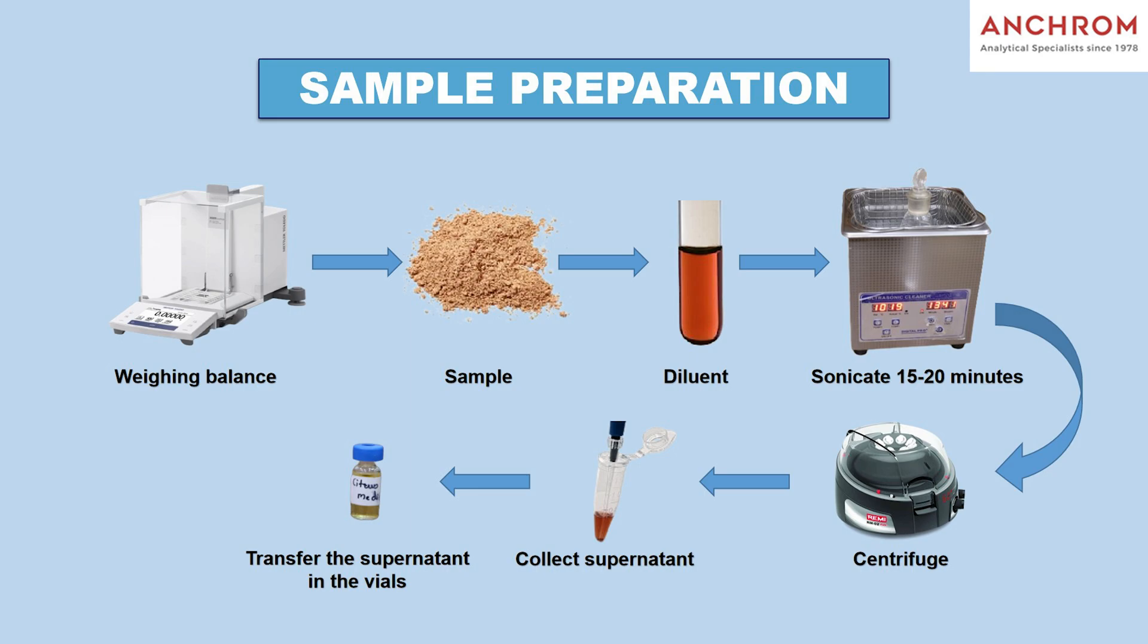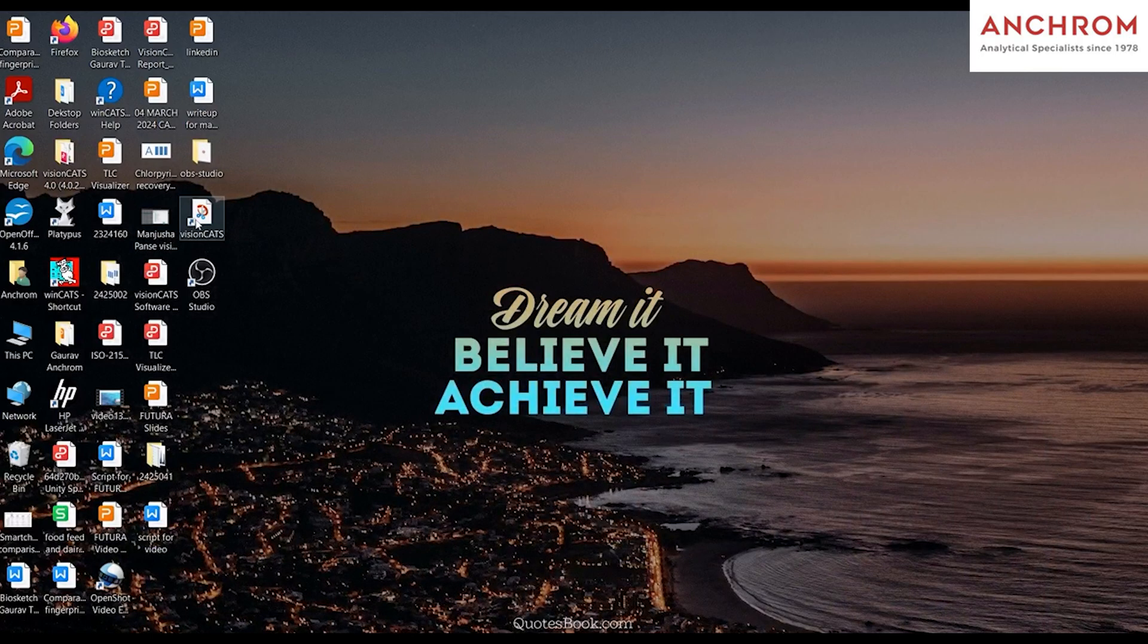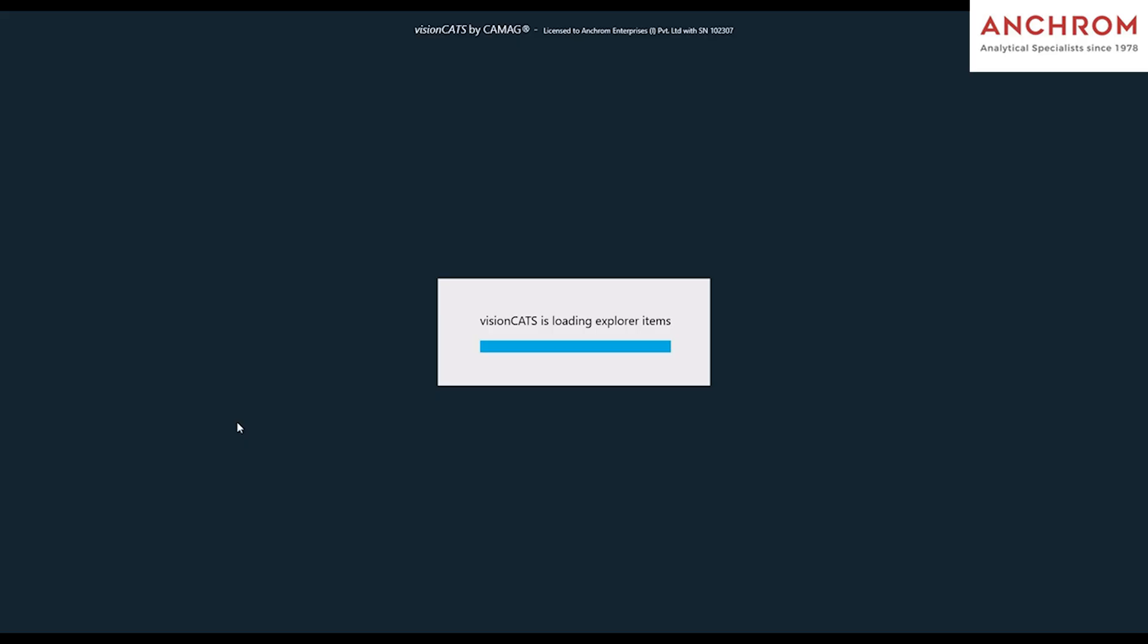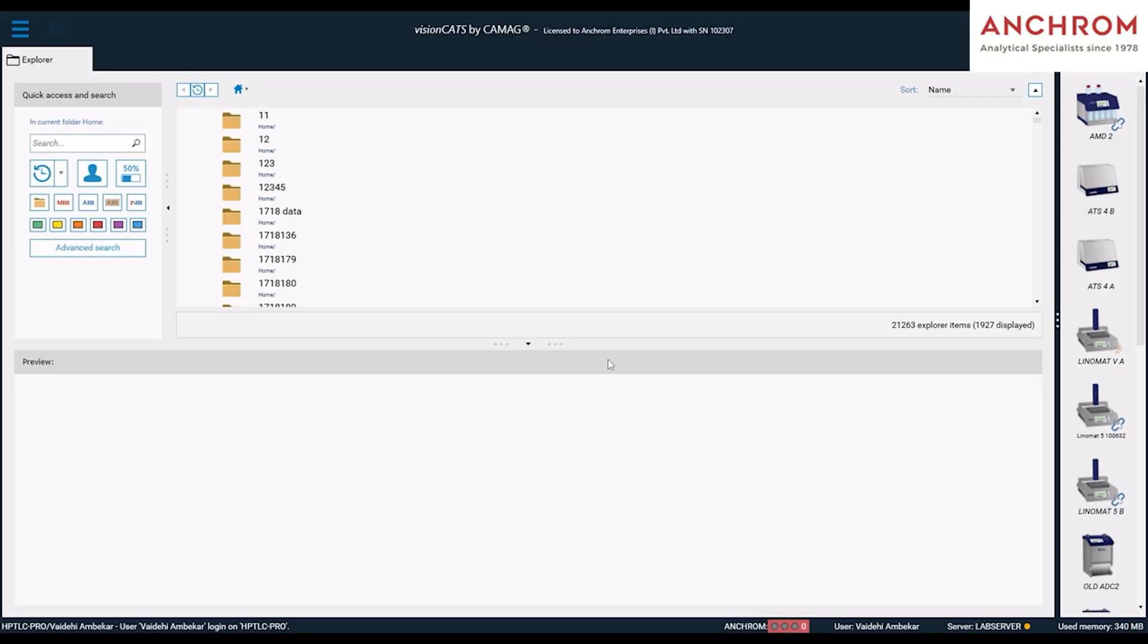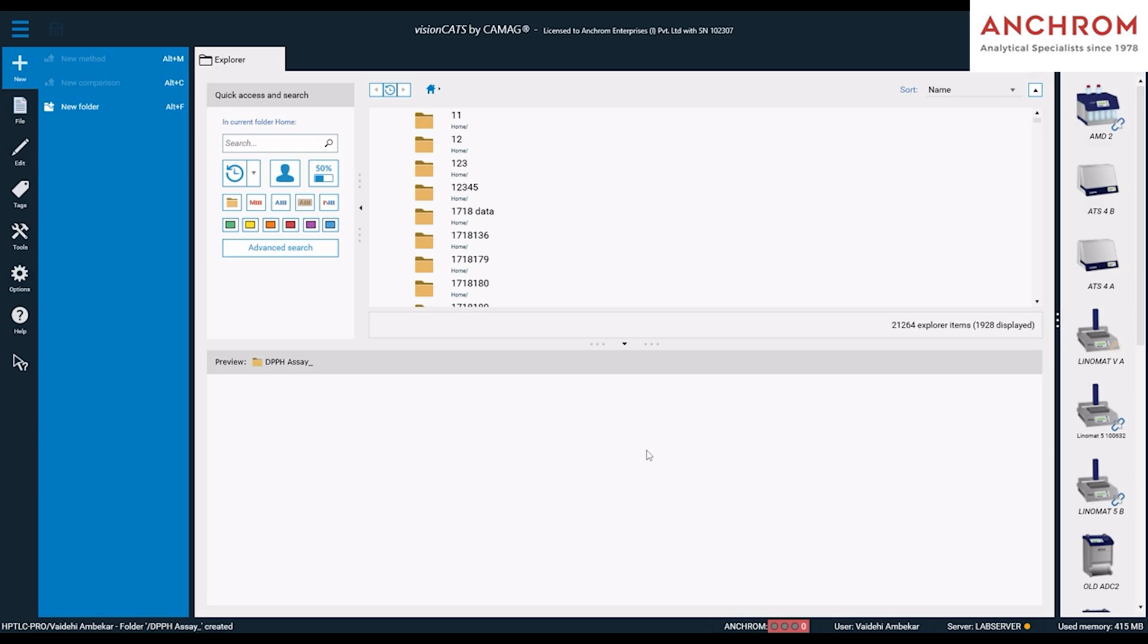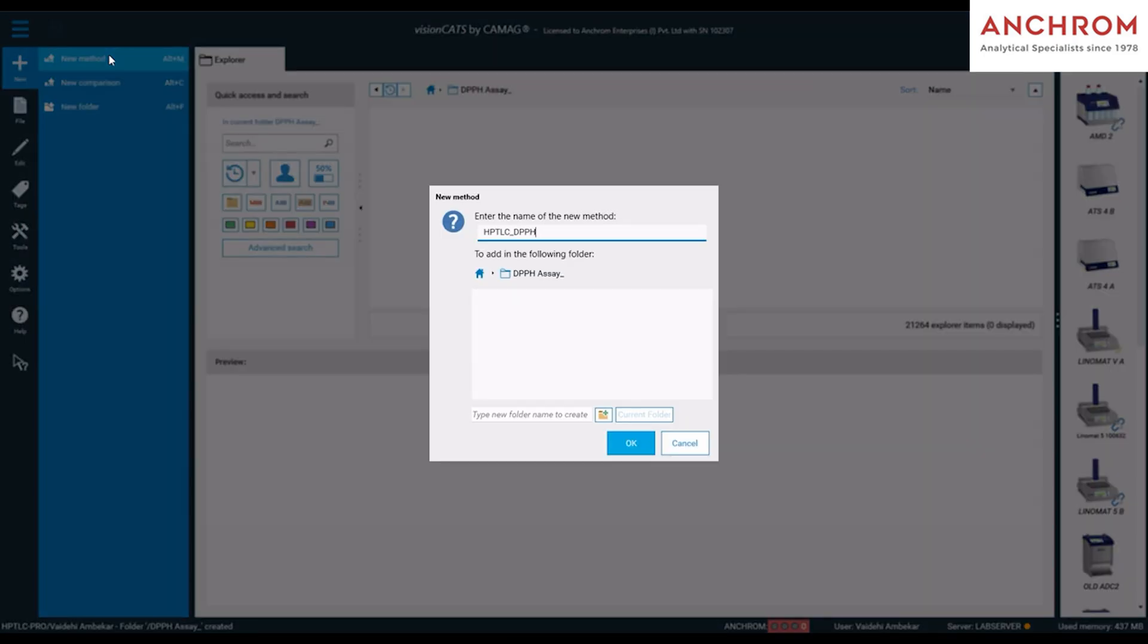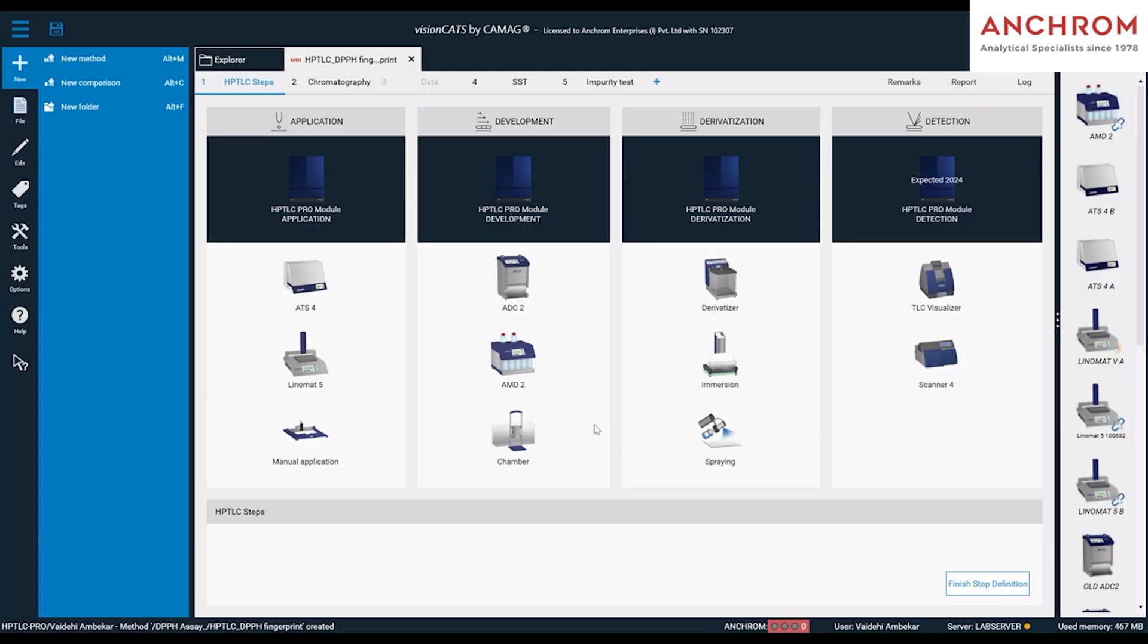Once our sample preparation is completed, we will proceed for the sample analysis. Perform the HPTLC analysis. Login to CAMAG visionCATS software 4.0 with your username and password. Create a new folder with a suitable analysis name. Now, create a method file in the same folder with a suitable name. Your method file will be created. Now, select the modules in the HPTLC steps.